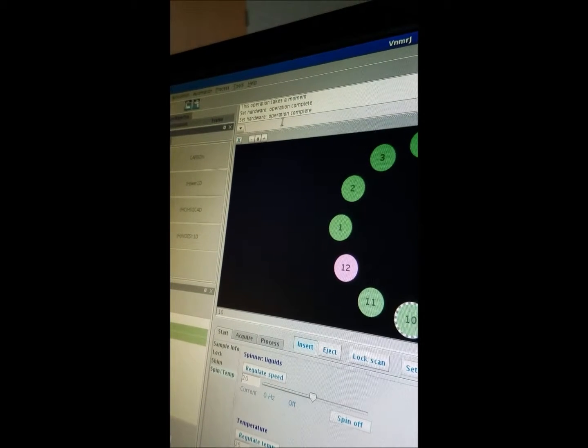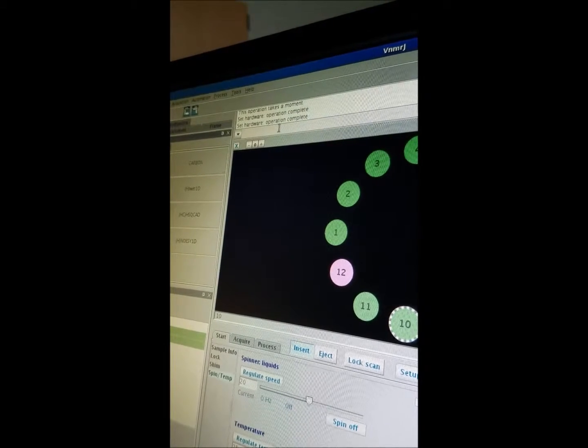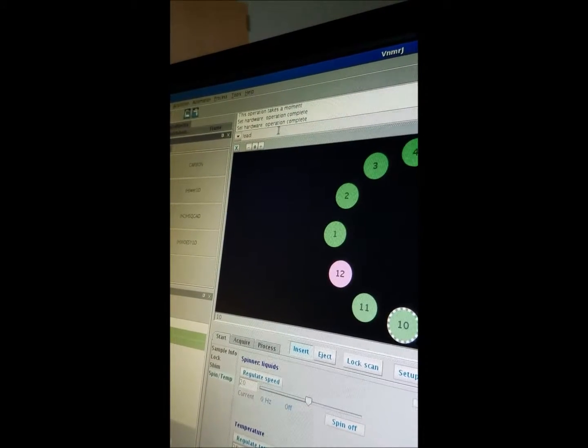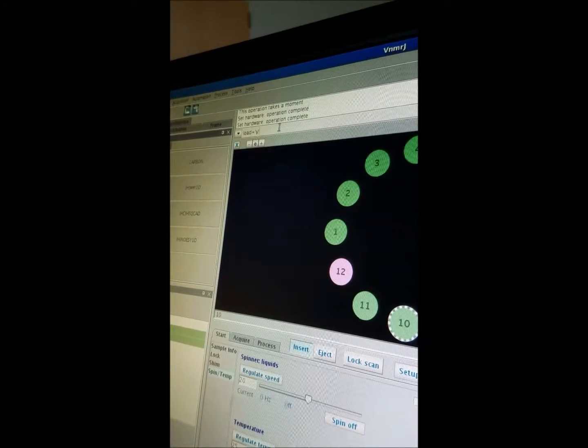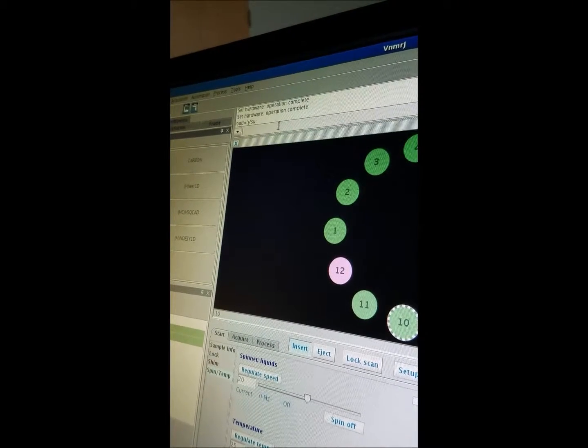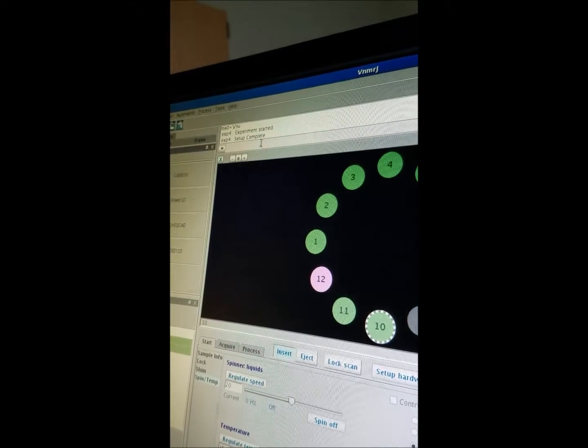So our next step is to go up to this space bar and load the shim. The first thing that you want to do then is type load equals apostrophe Y apostrophe SU. And then you see experiment started and setup complete.